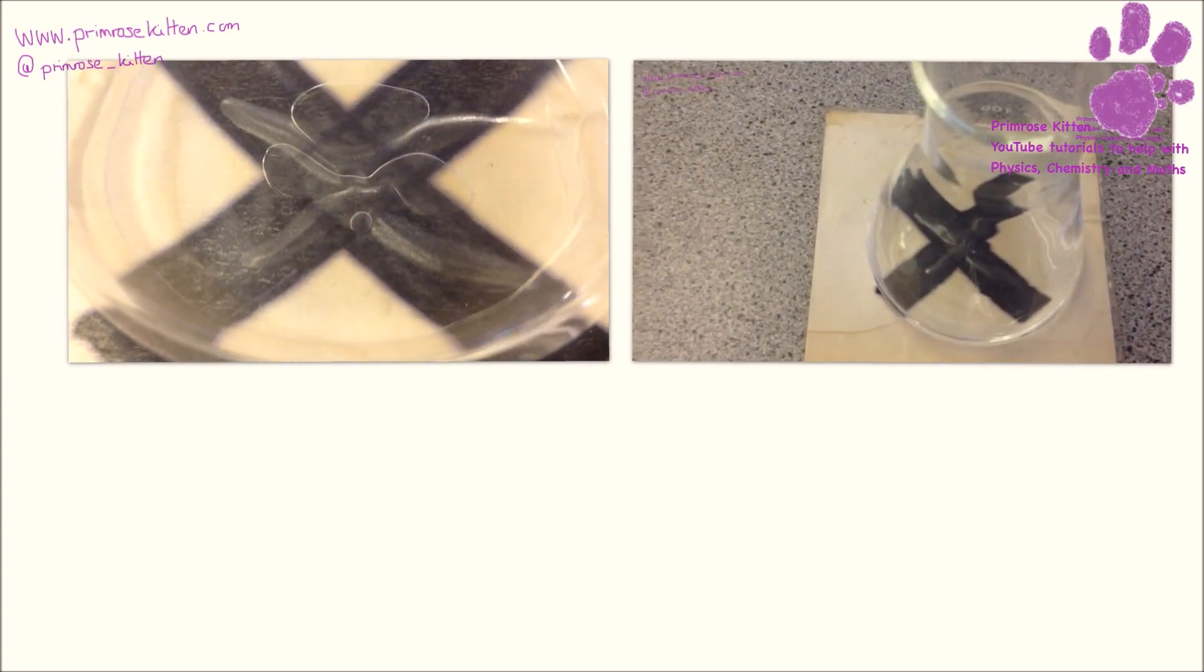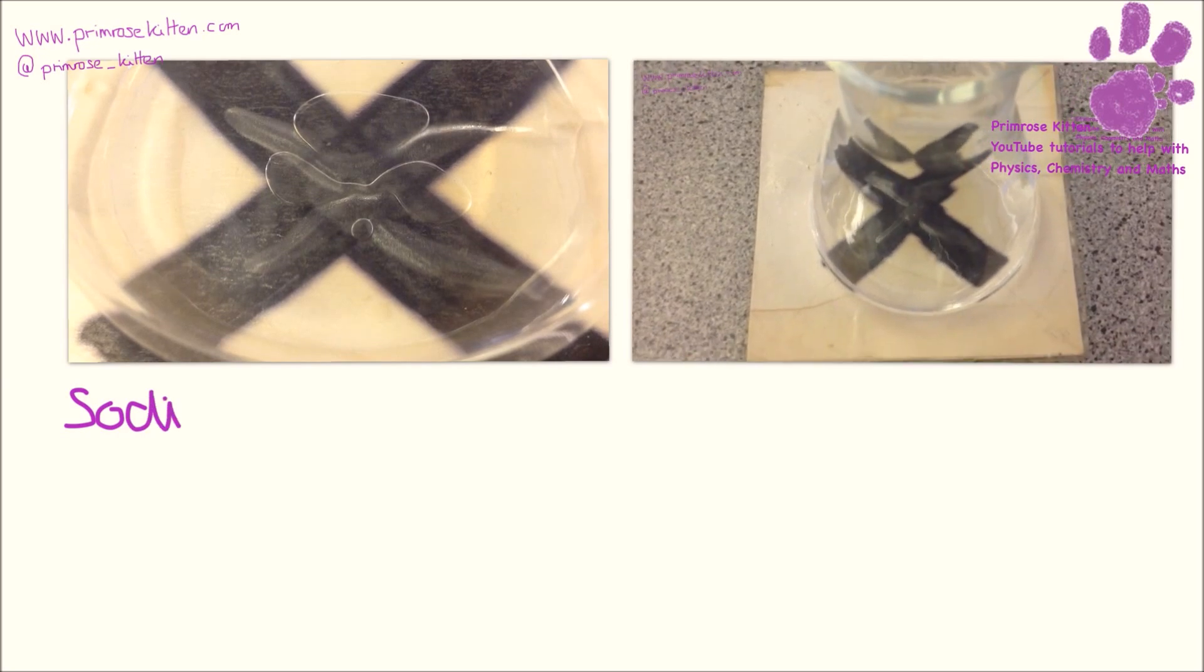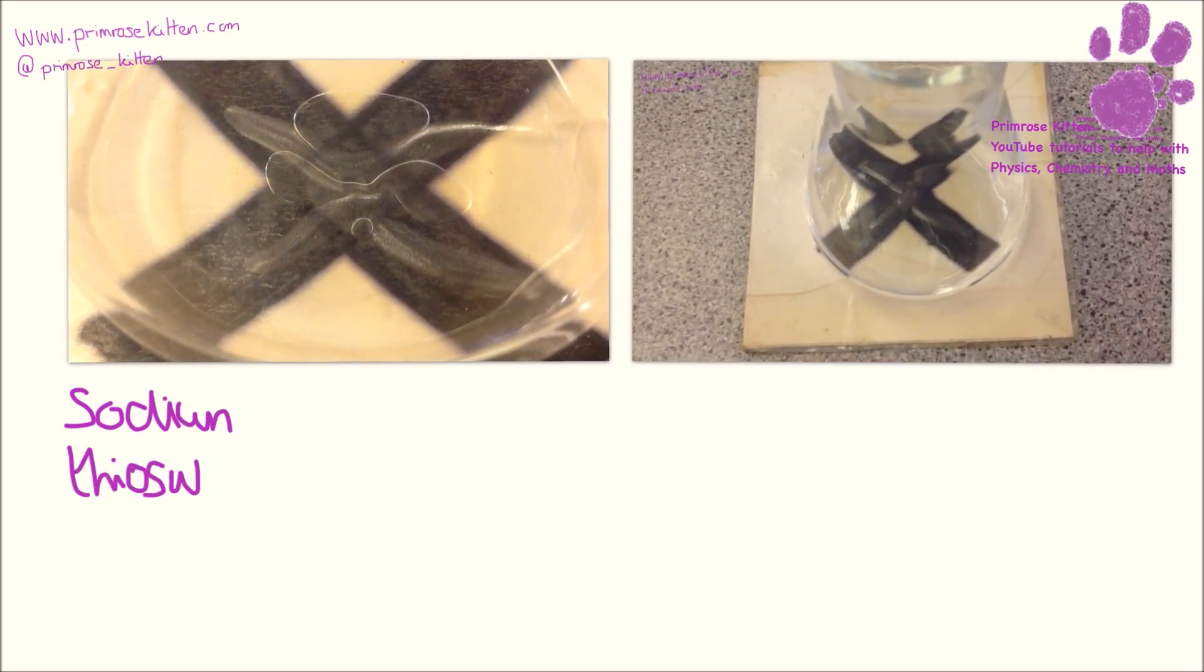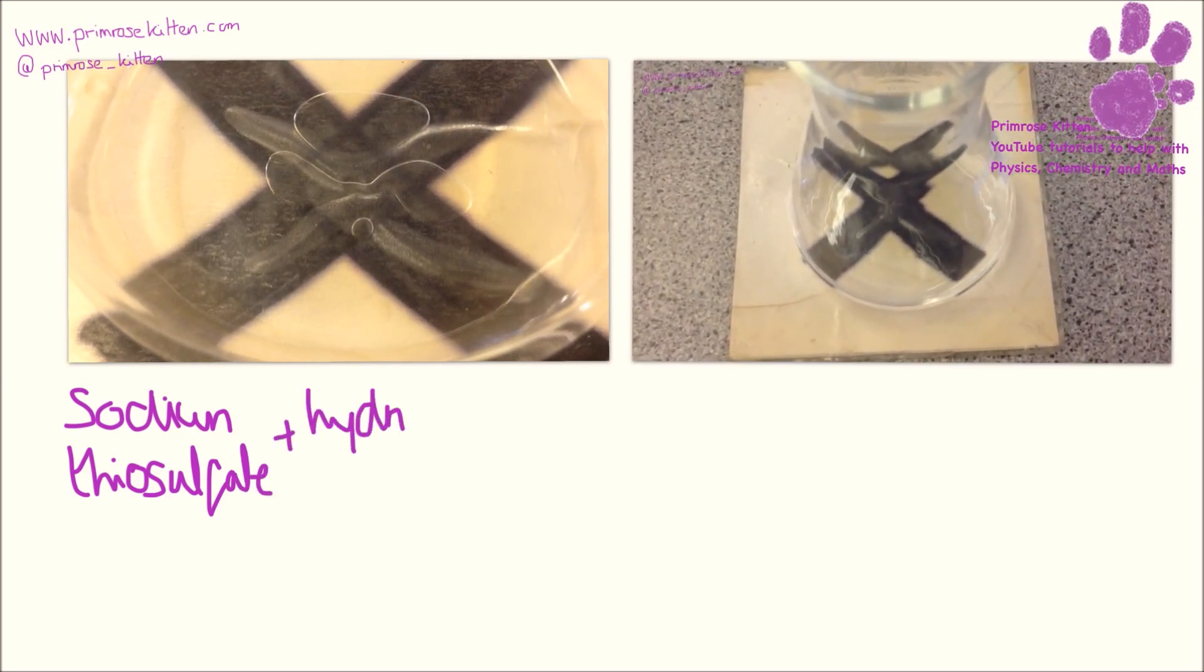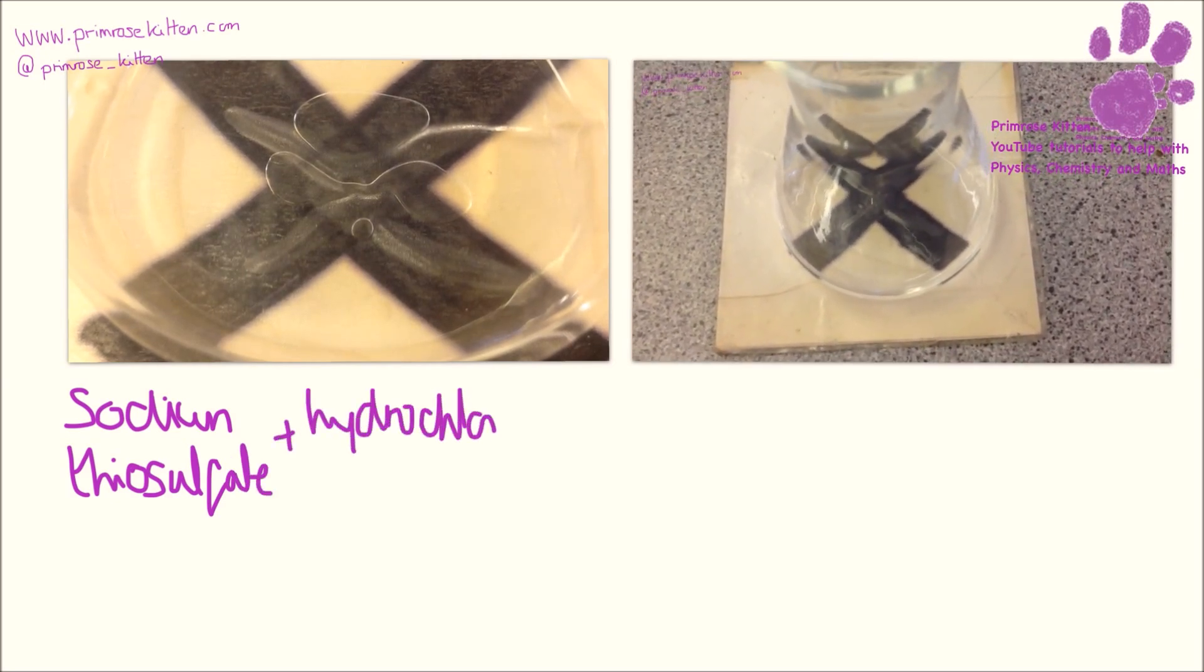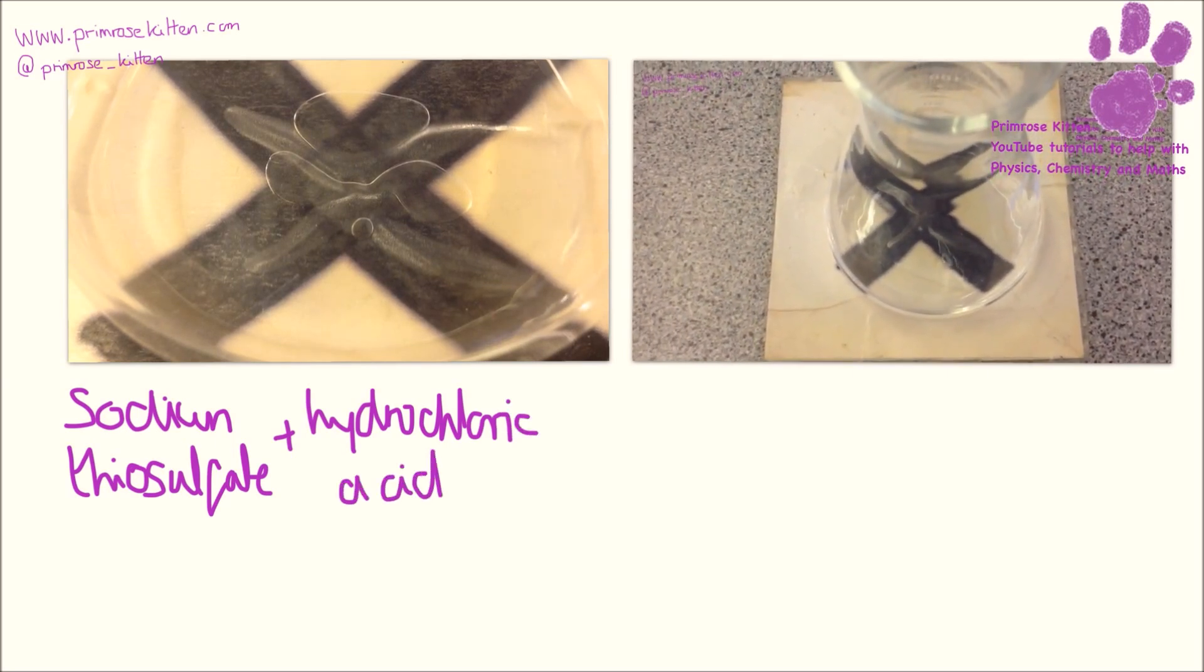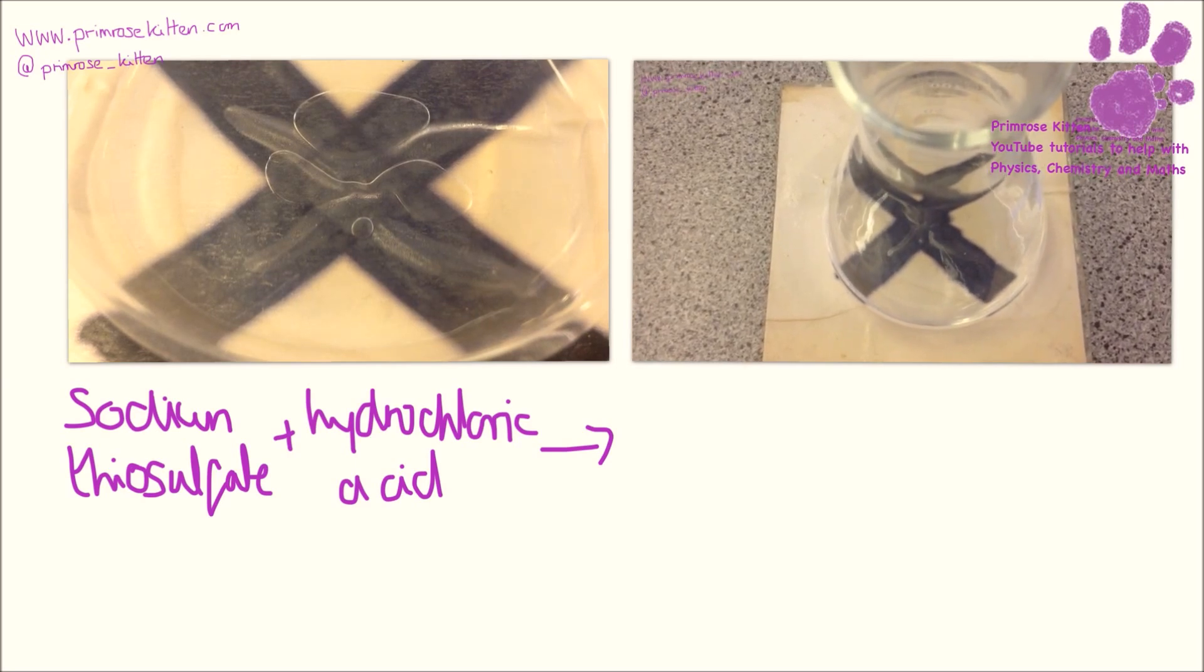We have sodium thiosulfate and hydrochloric acid. And as the reaction progresses, what you will start to see is that the solution goes a bit cloudy.